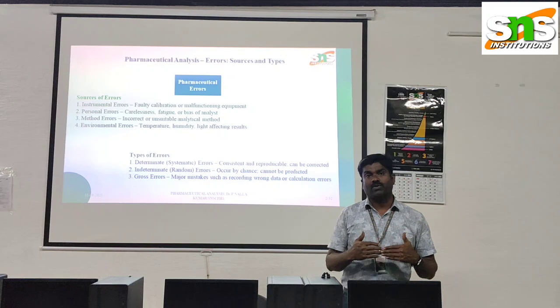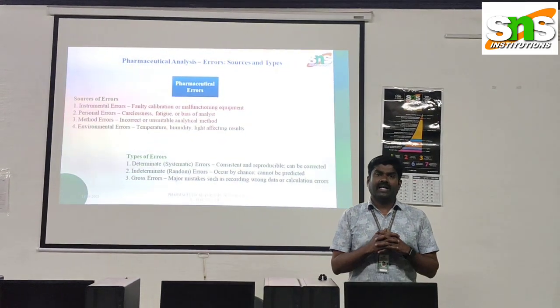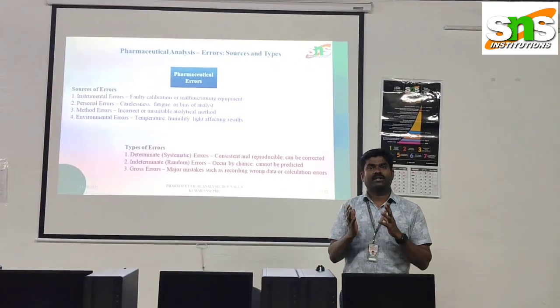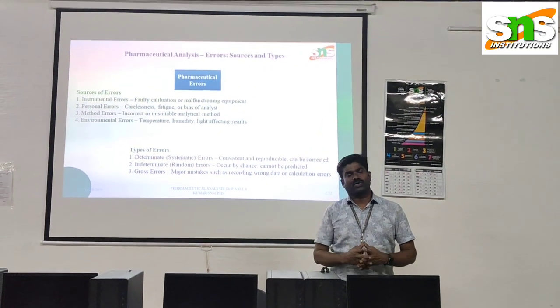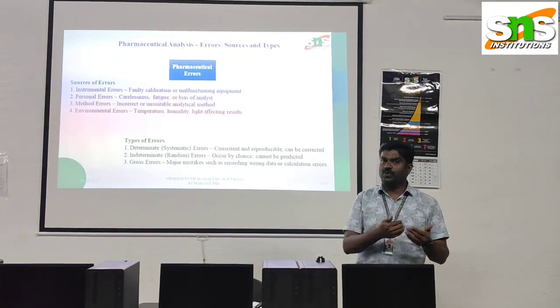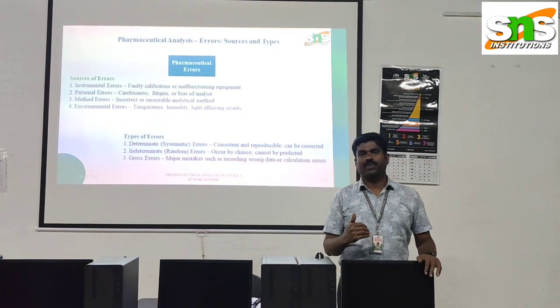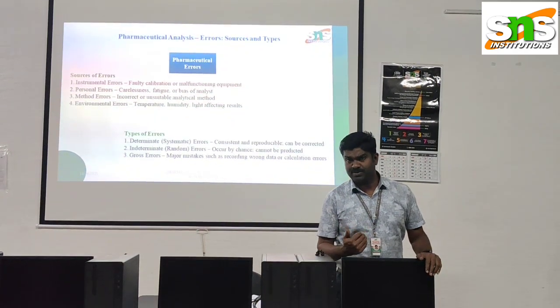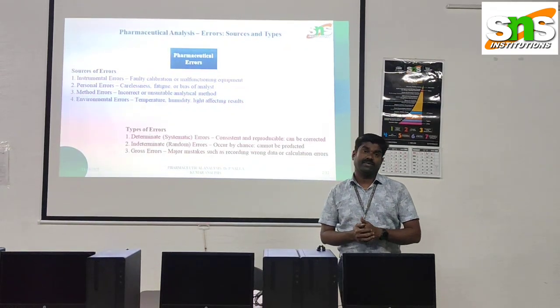Such a person's knowledge we need to share. If you have any doubts related to instrument handling, first clarify with the experts, and gain knowledge about each instrument used in this analytical area. Some basic information: how to switch on the instrument, how to switch it off, what protocols to follow before switching it on, and you need to follow the SOP properly. How we understand that SOP, standard operating procedure, and how we implement it when handling the instrument is very, very important.